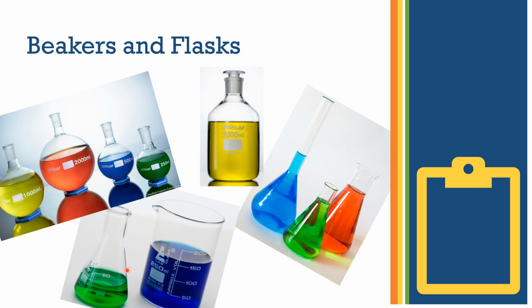Erlenmeyer flasks. These flasks have a conical shape with a narrow neck, which makes them ideal for mixing by swirling without the risk of spilling. They are also used for heating and can be easily covered with a stopper.